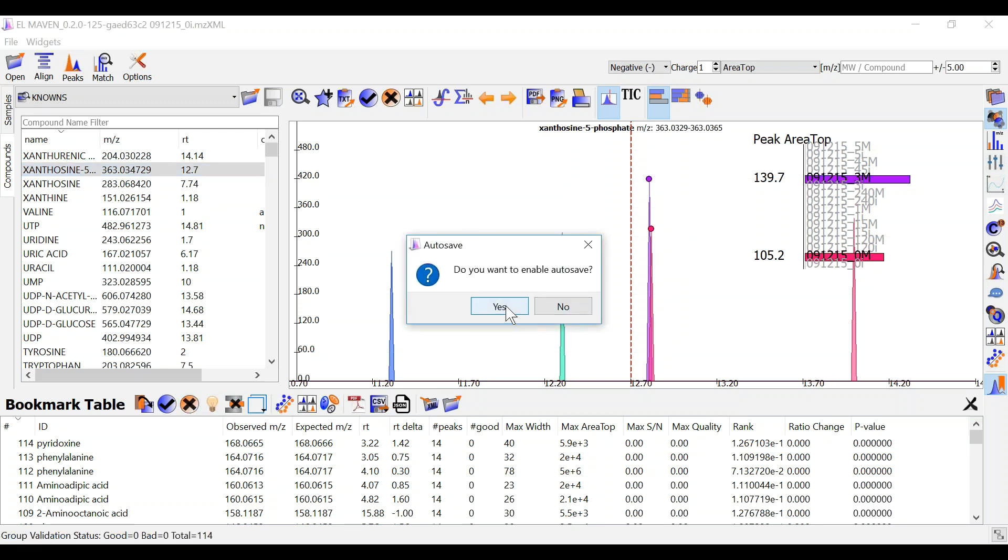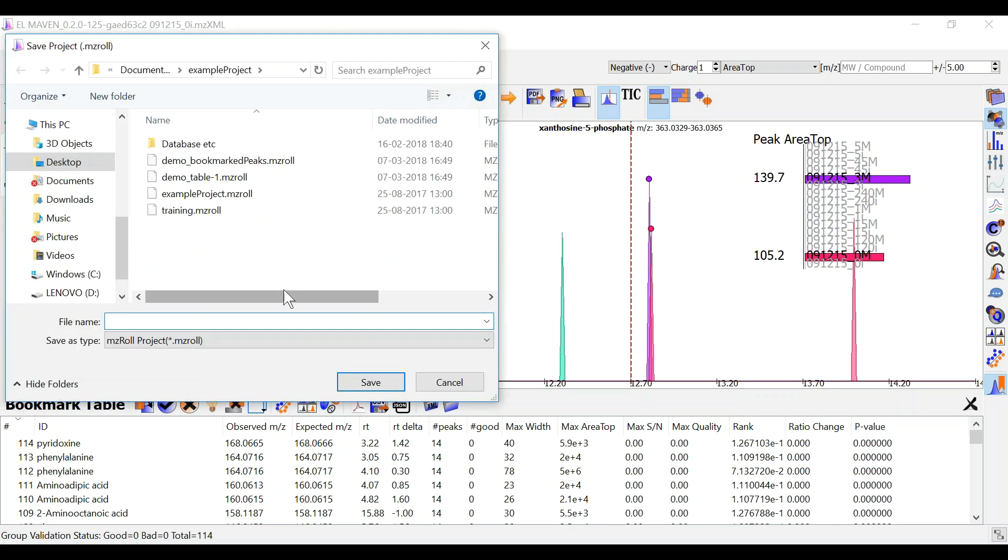You should enable autosave to save this data in a bookmark table and a mzroll project which you can also access later on.